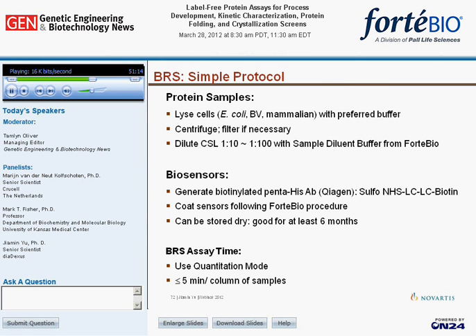Once you have the protein samples and biosensors, you can run the assay in quantitation mode. Because we're only interested in initial binding rate, less than 5-minute measurement time is more than enough for a column of 8 samples. And you can find all the details in our publication. Next slide.